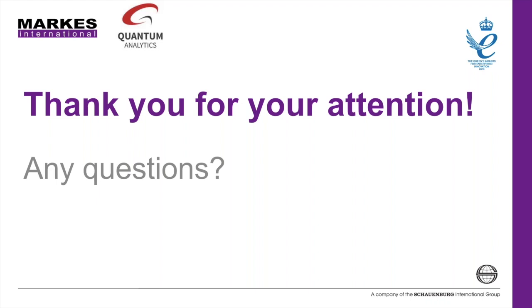Fantastic. Next question is, what is the primary column for formaldehyde detection? So the primary column, which was used to separate the C2 and the C3 compounds, but not the formaldehyde here, was an alumina PLOT, I believe. The formaldehyde column itself, I would have to check what that is. So Lauren, if you can take down the note of the speaker, and we can get in touch and see if that's the column they're actually looking for.